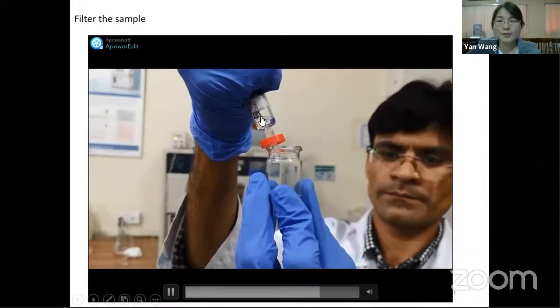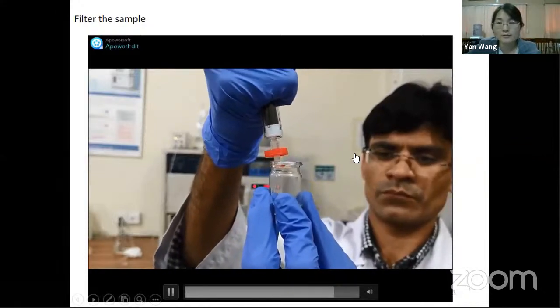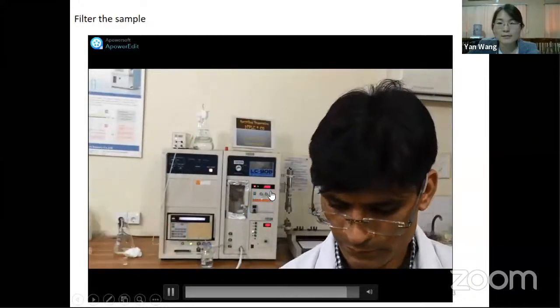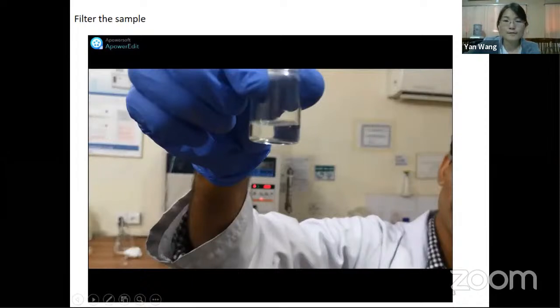If you have a sample and it's not dissolved properly or it's very dirty, lots of dust, lots of particles, then if the pressure is too high, it may start leaking and the sample will be wasted. So we should be careful when we use this filter. Okay, now we get a very clear sample solution.